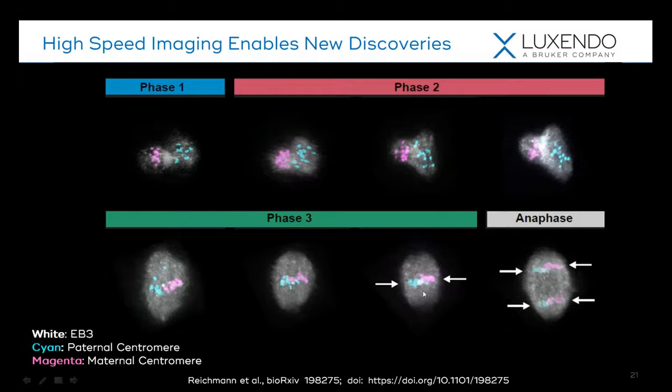mitosis, we'll see these line up, and then what we end up seeing is something that had been postulated but never actually observed: we watch as the cell undergoes division. It undergoes its very first mitotic division. It still segregates into the daughter cells that contain equal amounts of paternal and maternal genetic material, but this material stays spatially segregated as they undergo this first mitotic division.